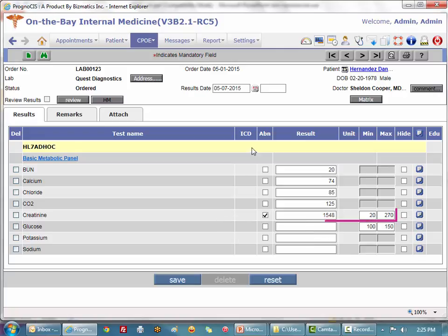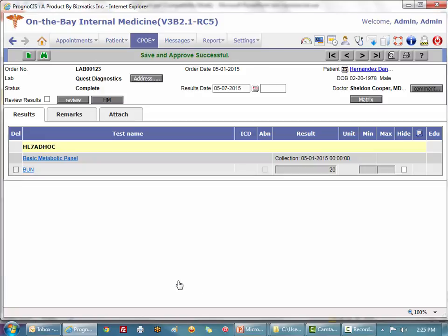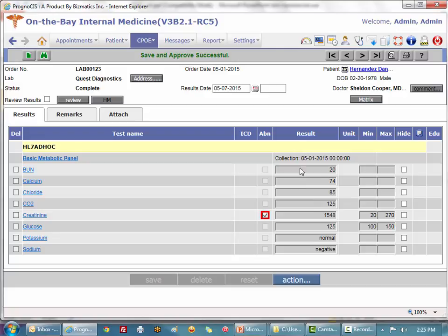Of course, some of these examples aren't going to make a whole lot of sense since I'm not a nurse. Now notice that one is way above range, so it flagged the abnormal automatically because it is one where the range is defined. Whereas when I'm within range, it does not indicate abnormal. And I'm going to just show you here an example that you can also key text in case it is that type of a test and does not come in numeric values.